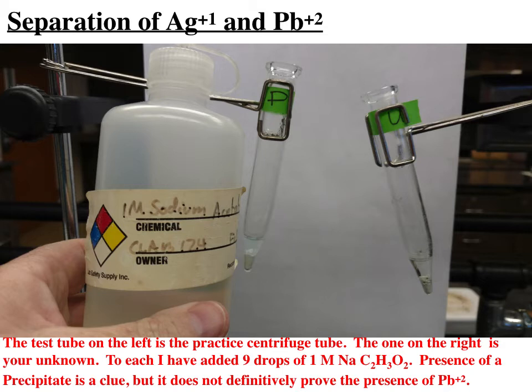But just because I see precipitate remaining does not tell me that lead was present in the initial sample. One thing I might be able to note is a change in the amount of precipitate. That would be a good indicator for sure, but I would still like a definitive test to know certainly that lead has been dissolved out of the precipitate and is now present in the supernatant in the form of a lead acetate complexation.